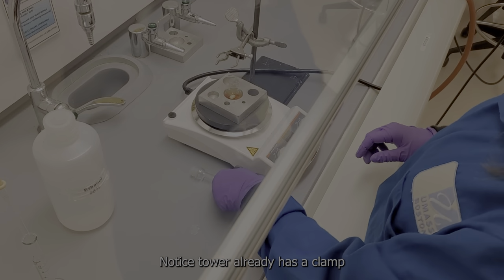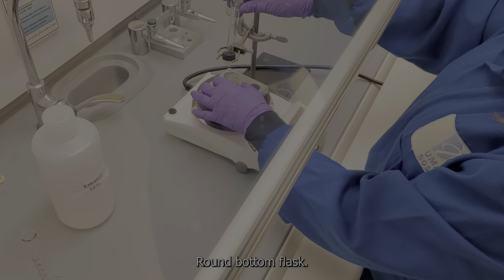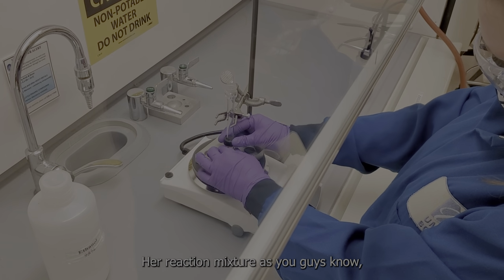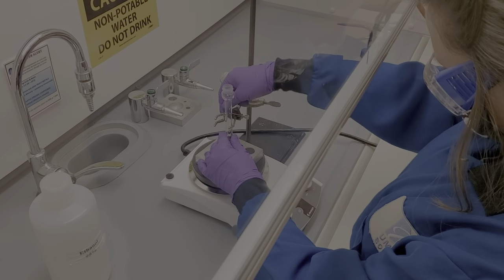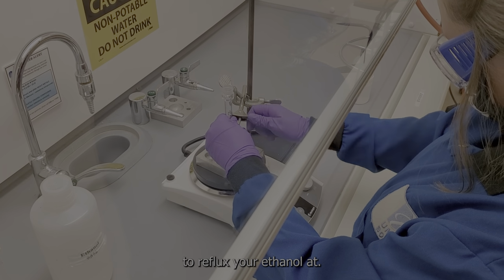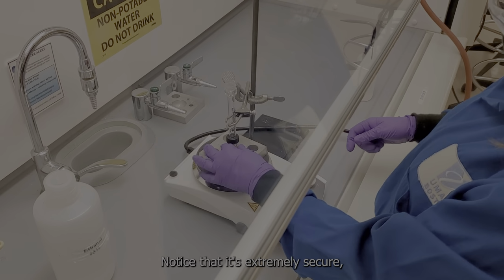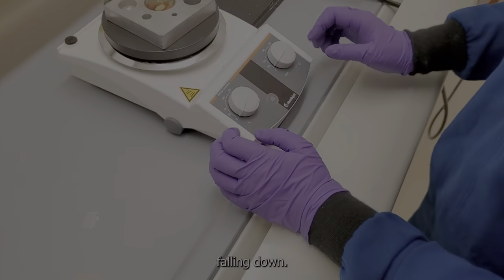Notice Tara already has a clamp set up to the side of her round bottom flask. Here she's going to add an air condenser to reflux her reaction mixture. As you guys know, ethanol is our solvent, so using the physical properties table, you should know what temperature to reflux your ethanol at. That's why this table is very important. Notice that it's extremely secure, so there's no chance of the flask falling down.